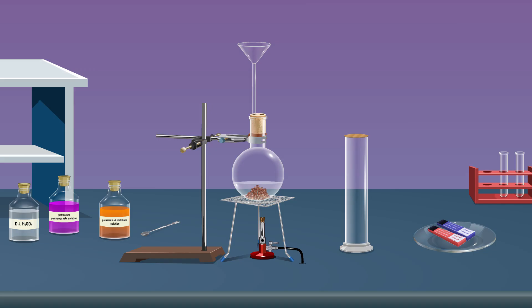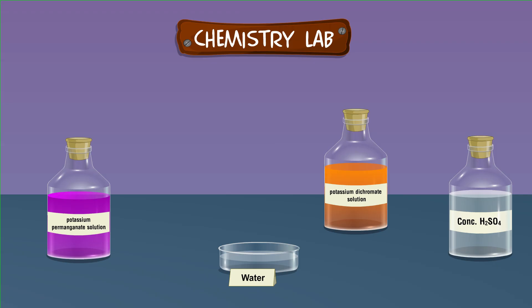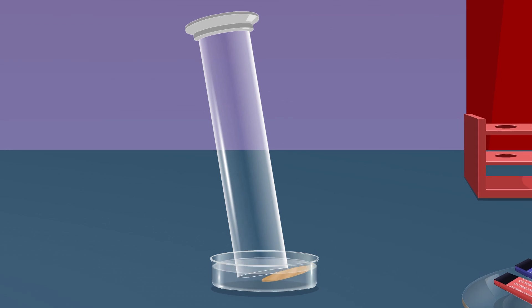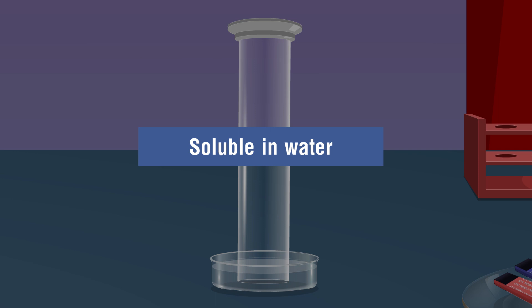Let us study the physical properties of sulfur dioxide gas. First, let us note the color — we observe that sulfur dioxide gas is colorless. Now we will look for its solubility in water. Take a water-containing trough, then invert the closed gas jar and place it in the trough, then remove the lid carefully. We observe that sulfur dioxide gas is soluble in water and it forms sulfurous acid.